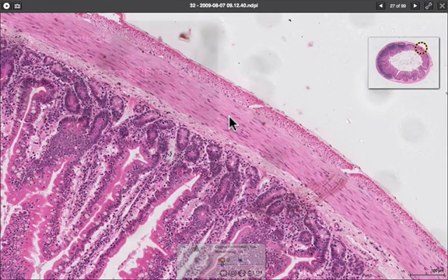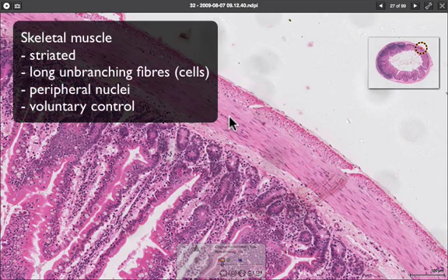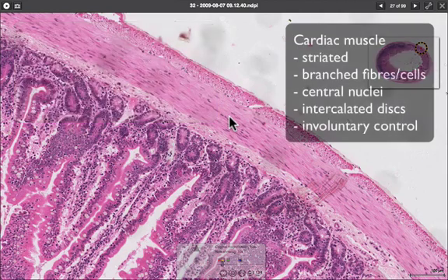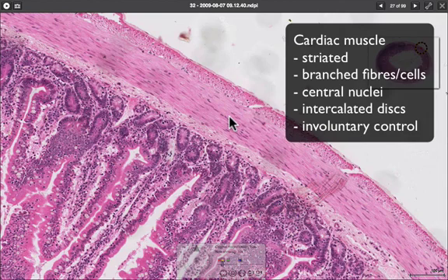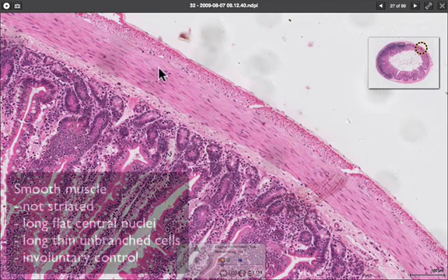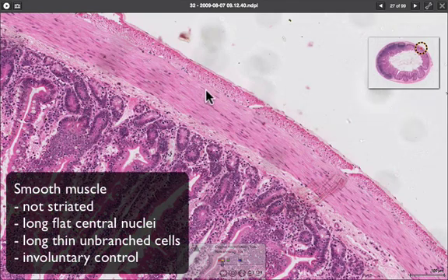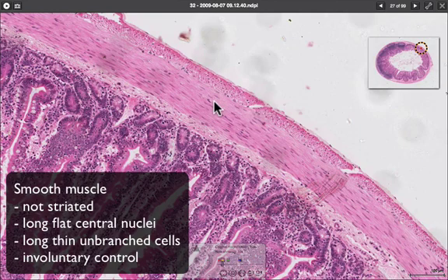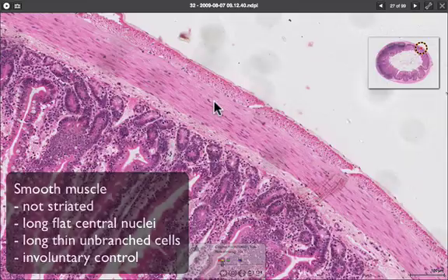In summary, there are three types of muscle cells in the body. Skeletal muscle is striated, has peripheral nuclei, non-branching fibers, and is under voluntary control. Cardiac muscle has branched fibers, central nuclei, and intercalated discs between fibers, and is under involuntary control. Smooth muscle has flat, central nuclei, no striations, and is also under involuntary control.